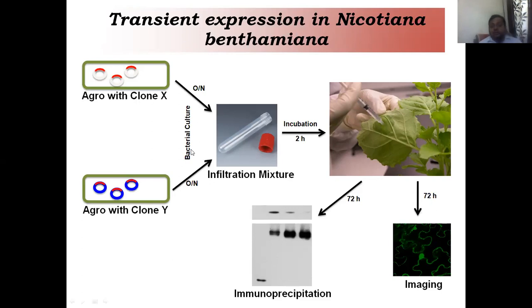So what happens, say, we have specific purposes or specific needs for using this particular experiment. Of course, in cases where we just want to check where a particular protein is localized or whether two proteins are interacting, we might or might not have to generate transgenic plants. Of course, we can do that. Nobody is stopping us, but we might not have to.